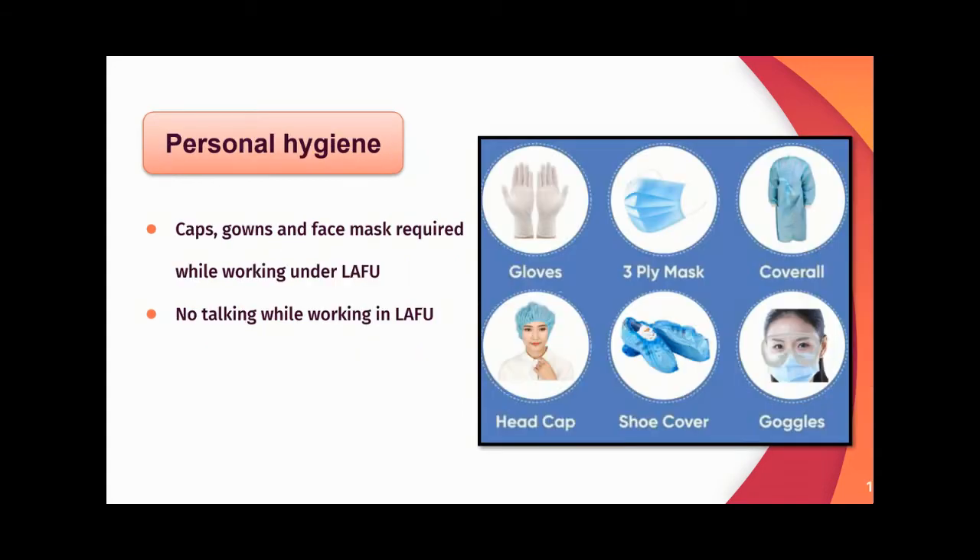For personal hygiene, caps, gowns, and face masks are required while working in the lab. No talking should be entertained while working in the lab.